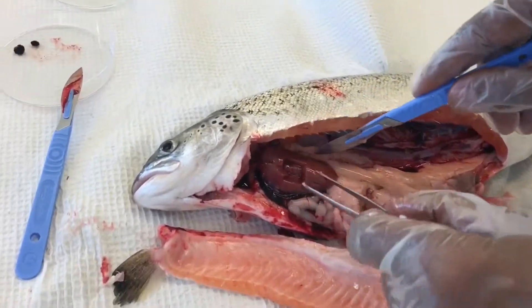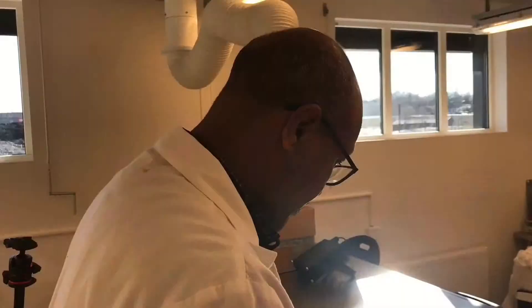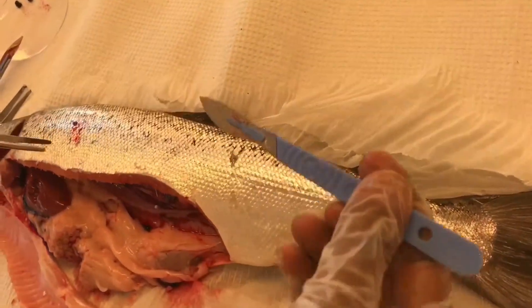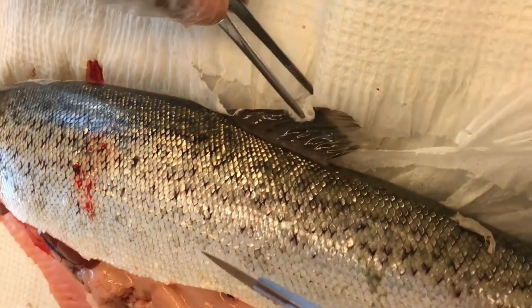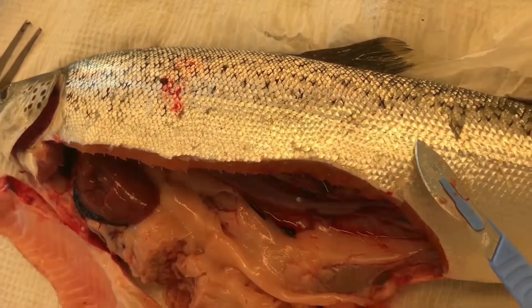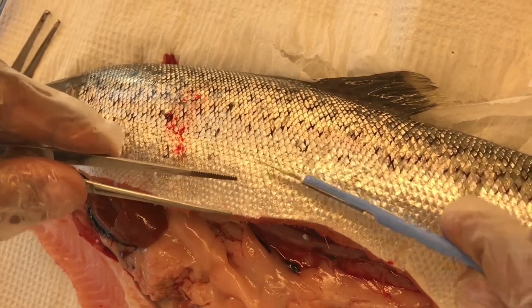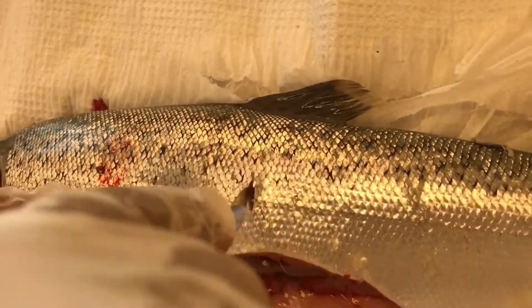So we took samples from the heart, liver, pancreas, pyloric cecae, spleen, and kidney. Next, we are going to take a sample from the skin and muscle together. Locate the dorsal fin, then just below it try to locate the lateral line. Take a good portion of the skin and muscle just above and below the lateral line, including the lateral line itself, making vertical incisions.